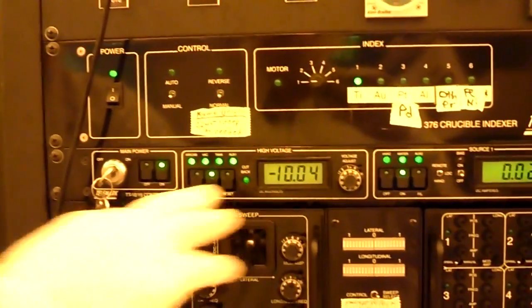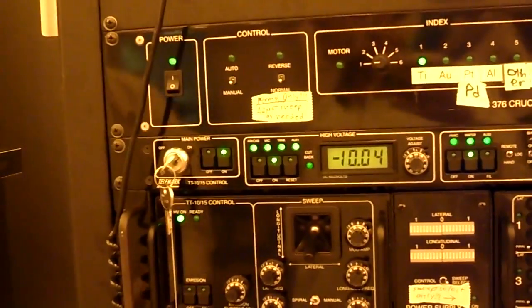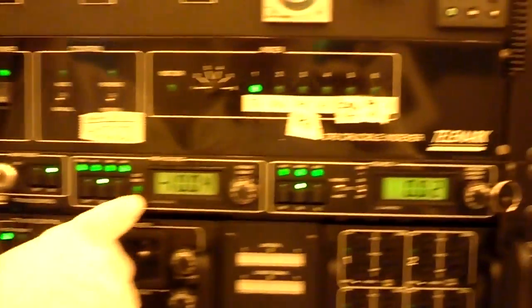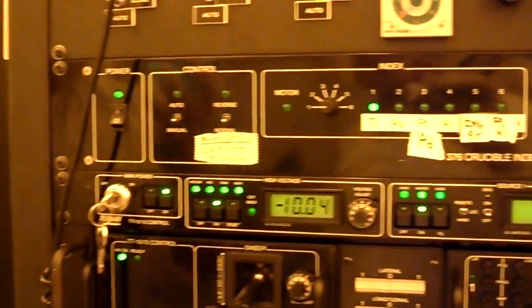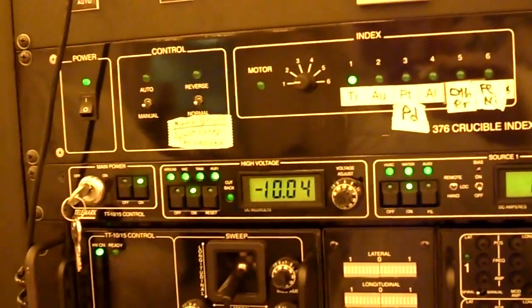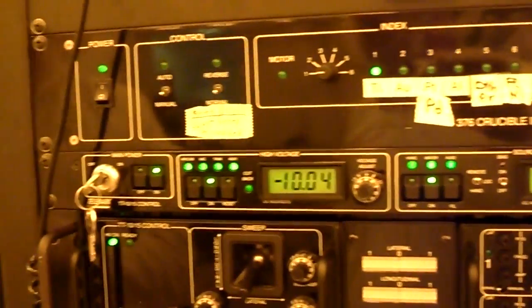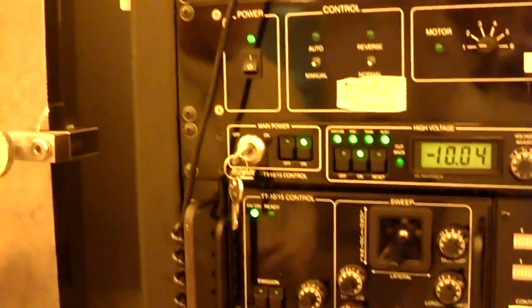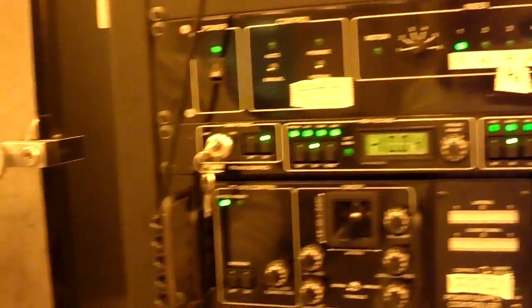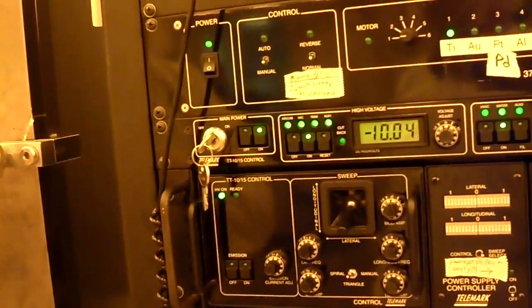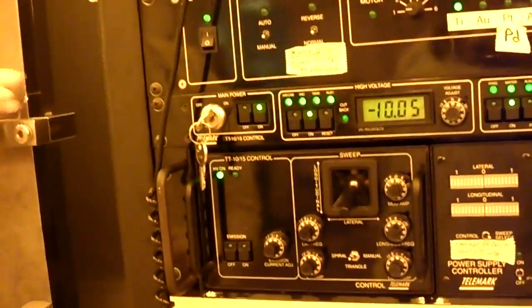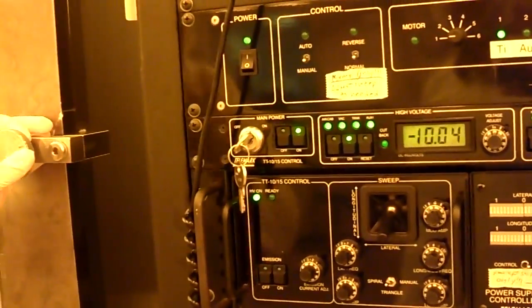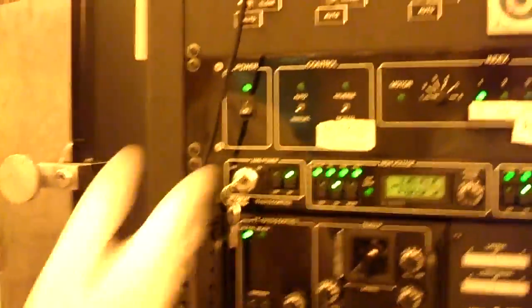And so it will temporarily, for a couple of milliseconds or whatever, turn the beam off and back on. And when it does that, it will reestablish in the right position. It won't find a ground over here. It'll go back through your source. And so you'll see that flicker sometimes to full brightness. If it ever goes to full brightness and stays there, what that means is you have a short, probably a piece of metal stuck between the two electrodes on the filament. So in that case, what you have to do is turn the high voltage off, turn it back on. It might fall away and you can keep going, but it might not, in which case you'll have to pump out. All the more reason to clean up the chamber when you prep.